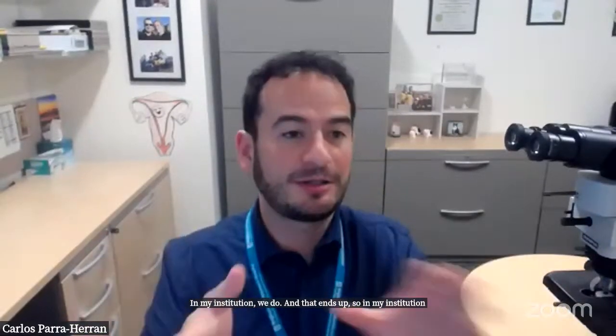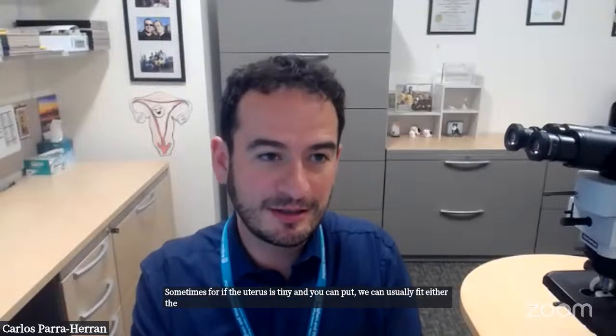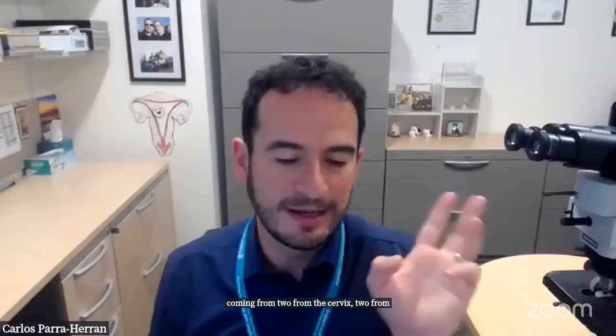In my institution, a hysterectomy like the one you described will have 6 blocks. Sometimes 4 if the uterus is tiny, and we can usually fit either the 2 cervix sections in a single block, or the cervix and the section of the lower uterine segment in the same block. So we end up with 4 blocks. But more often than not, what I see is 6 blocks: 2 from the cervix, 2 from the lower uterine segment, and 2 from the uterine corpus.